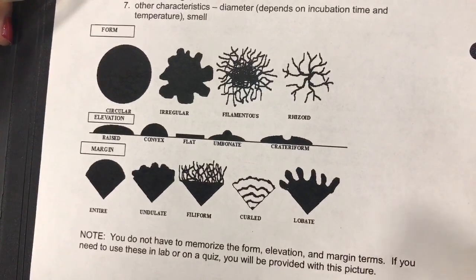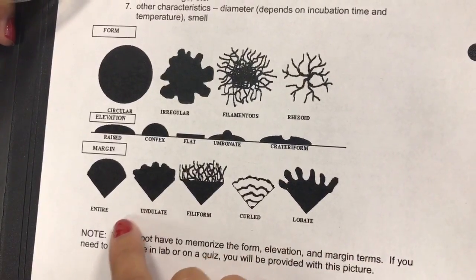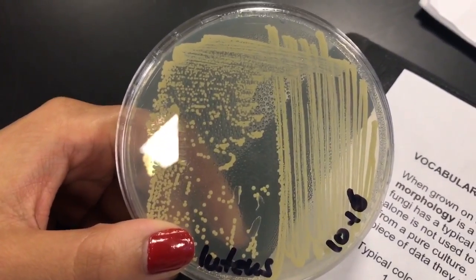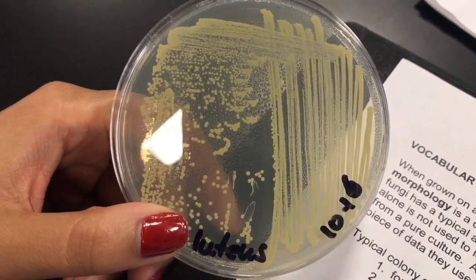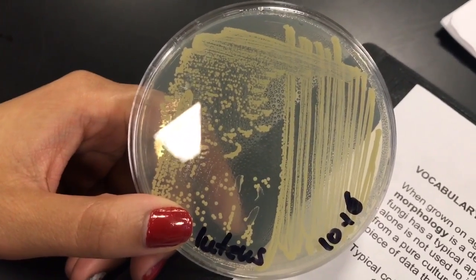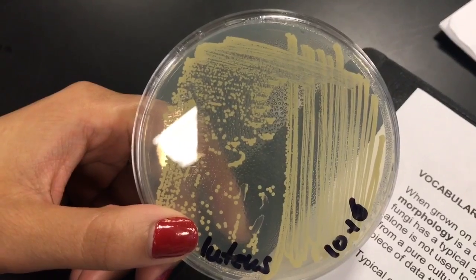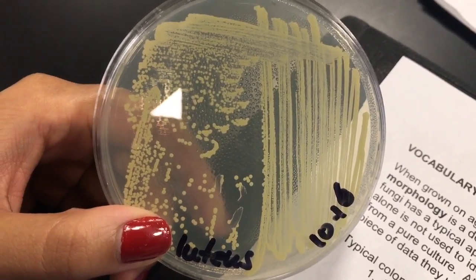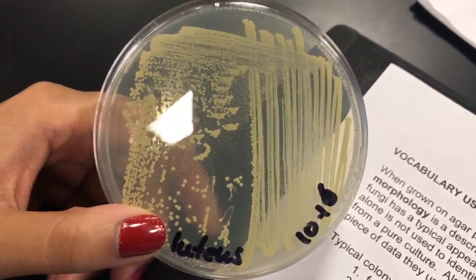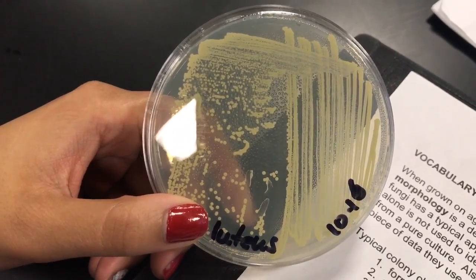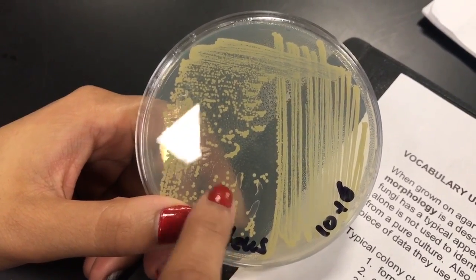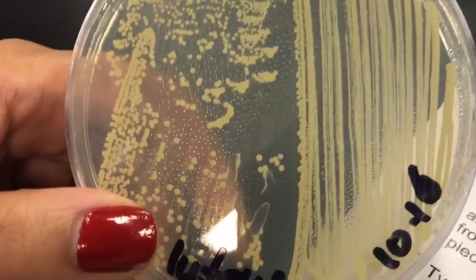The margin is entire throughout, because its edge or borders are circular. Its optical properties are opaque, because light is not translucent through it. Its texture is soft, which you can test with an inoculating loop by touching it. Its pigment is really going to help identify this organism — as you can see, it's very unique and is a yellow color. Other characteristics include measuring the diameter, though there will be variance in diameter across different colonies.